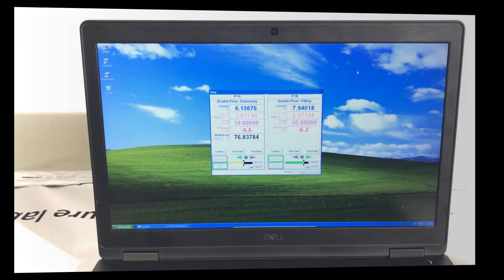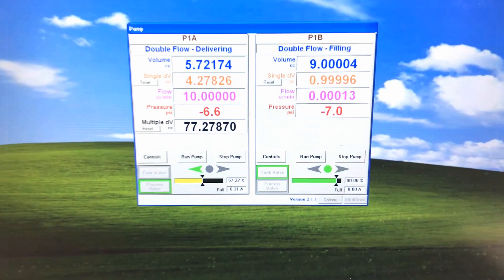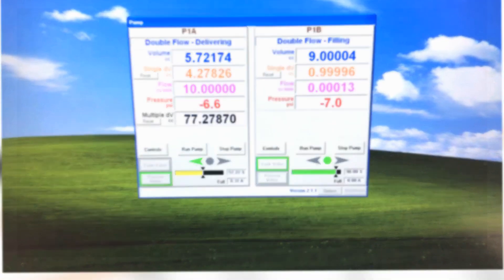The control software is required to configure, control, and operate the pump cylinders. It includes several operating modes such as constant flow rate or constant pressure.